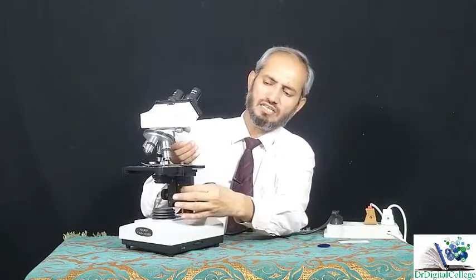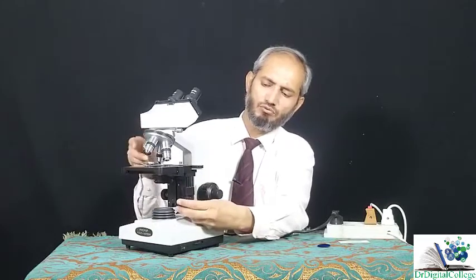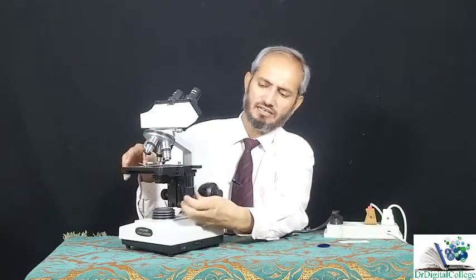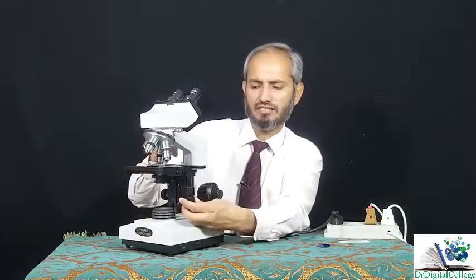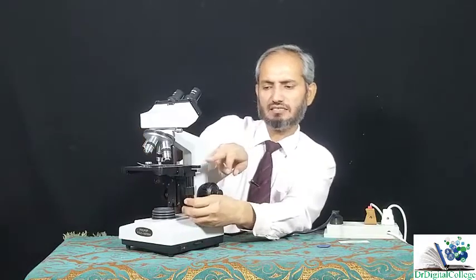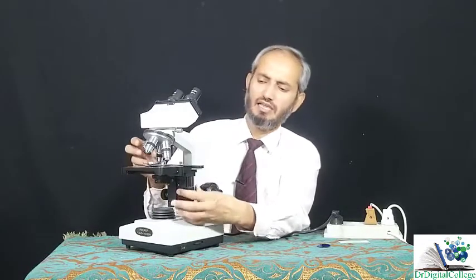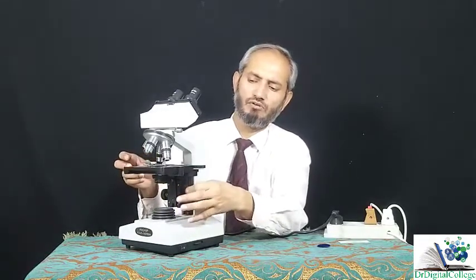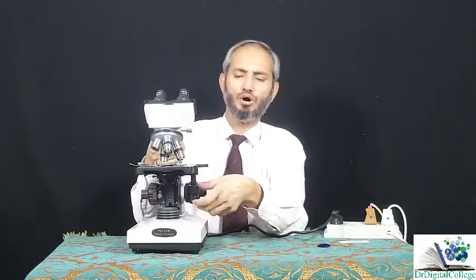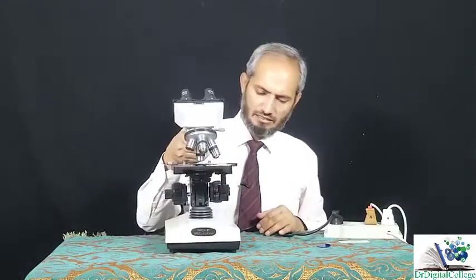One thing I have told you, that these are two knobs. This can move the stage backward and forward like this. This knob can move the stage right and left, meaning your object is being moved here like this. This clip is holding the object, and this way the whole stage will be moving forward and backward. These two knobs are actually used to locate your object exactly beneath your objective lens.